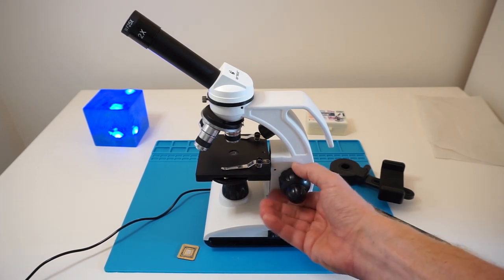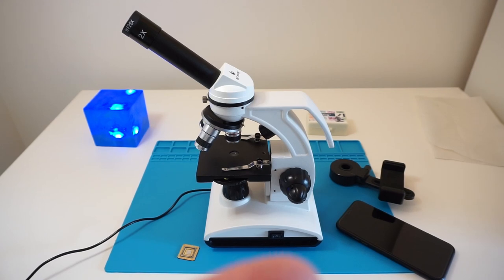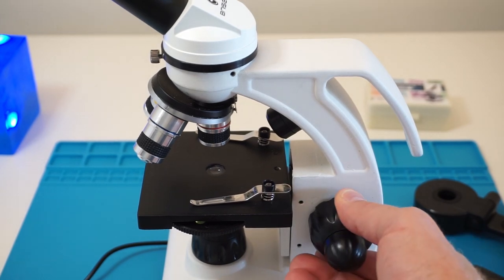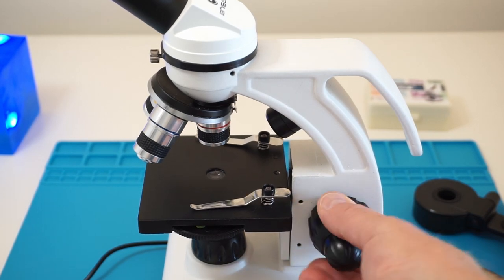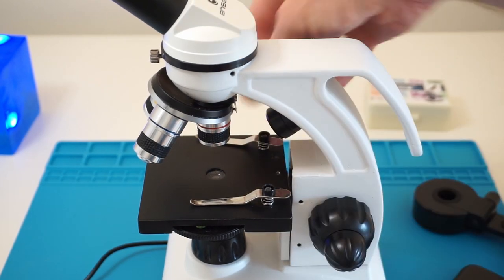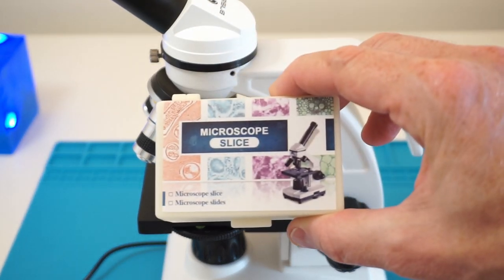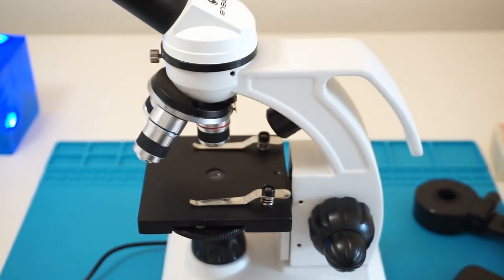There is a table attached which you can modify the height, the coarse focus, the fine focus here. You see how this works. I can zoom in a little bit. So this is the coarse one, and you see also the fine one moves. This is the tablet, and there you can also fasten or fix some of these microscope slides, which are part of the microscope if you buy it. Okay, well, let's now look at the system.